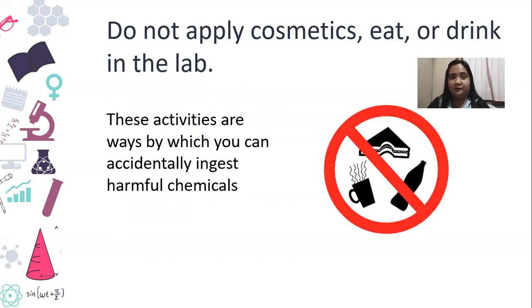Well, it says here, do not apply cosmetics, eat or drink inside the lab. This is very important. These activities are ways by which you can accidentally ingest harmful chemicals. Of course, to maintain orderliness and cleanliness of the lab, that's one reason. But the primary concern is we don't want you ingesting something toxic or any harmful chemicals. So no eating, no drinking, and of course, no applying of cosmetics. A little powder will do, but not really full makeup.